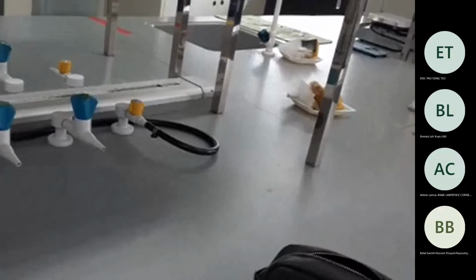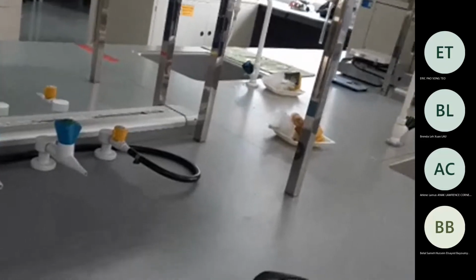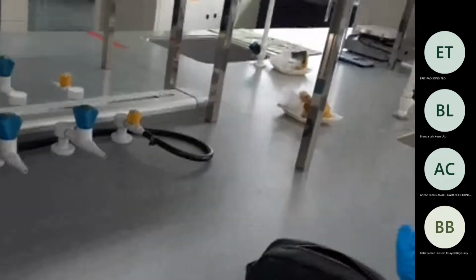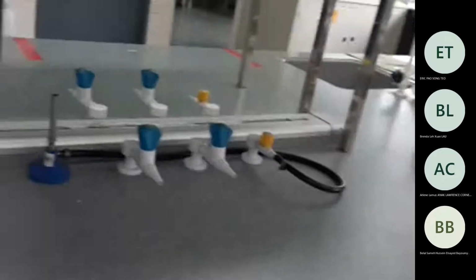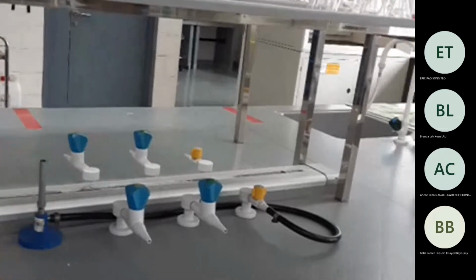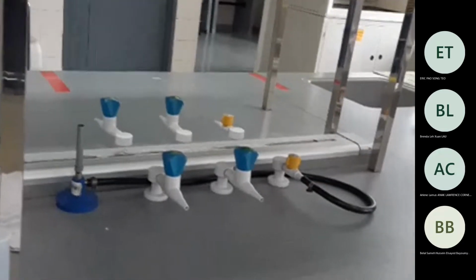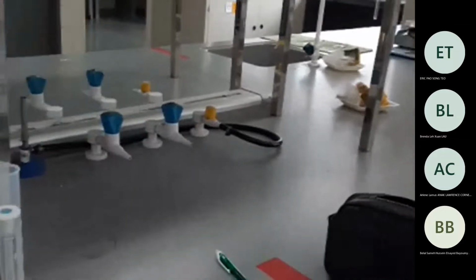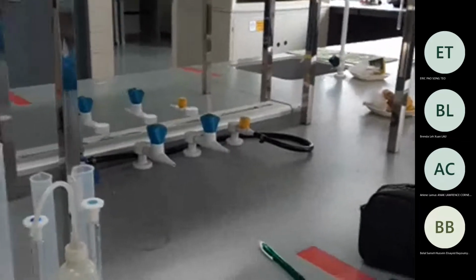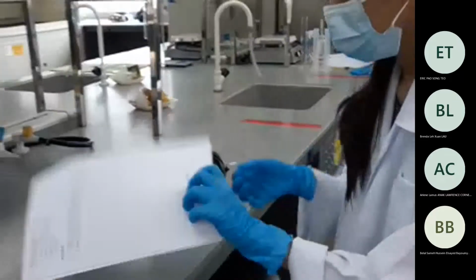We will first do the hydrochloric. It doesn't matter whether you want to do hydrochloric acid first or the CH3COOH, ethanoic acid, first. It's up to you. But the thing is, we need to dilute it first. So how do we dilute it? 1:10, right? So you take 10 milliliter and dilute to 100 milliliter in the volumetric flask. This is a volumetric flask, by the way, some call it round bottom. So yeah, that's it. I think we can start now.